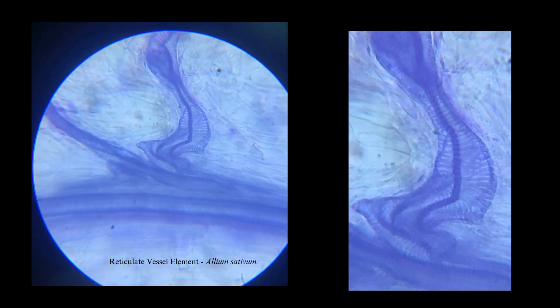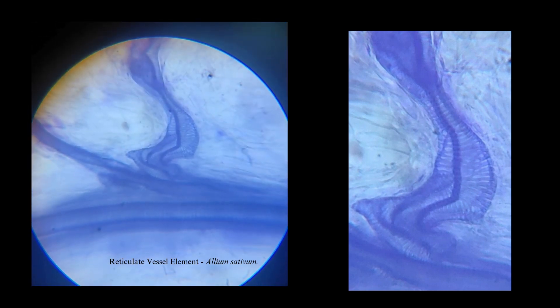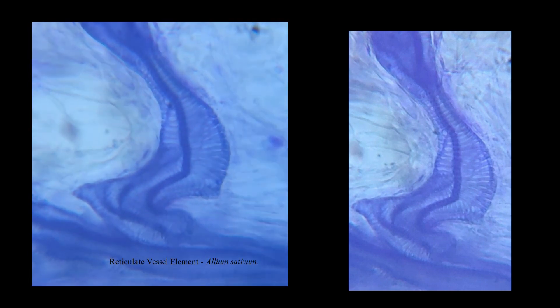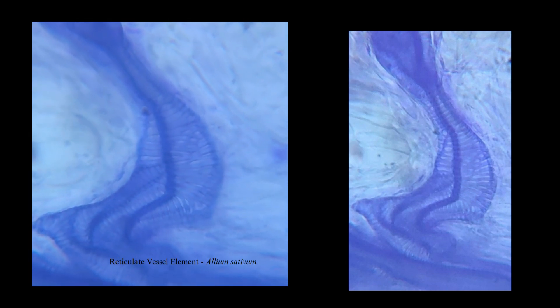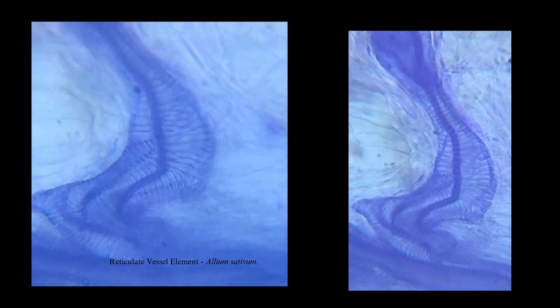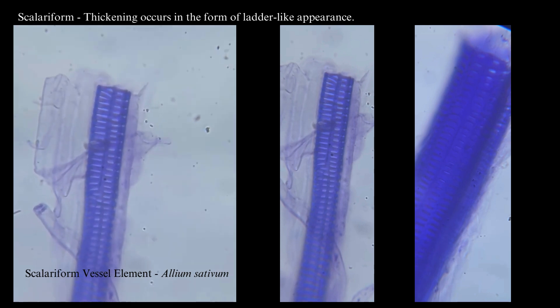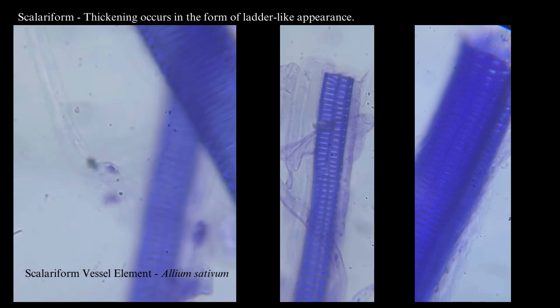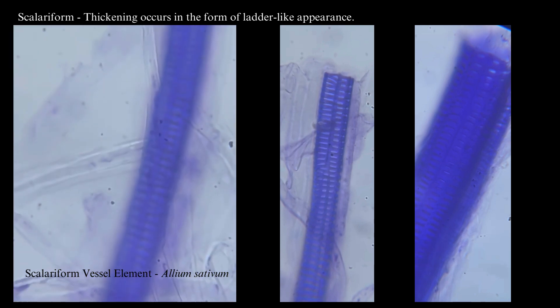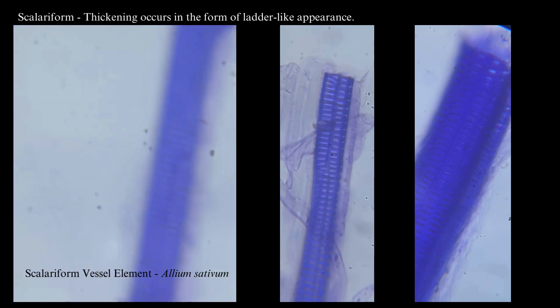Here again is the garlic outer peel macerated slide where you can see the tracheary element with the reticulate pattern. This is the scalariform vessel element of garlic flower stalk. Here the thickening occurs in the form of a ladder-like appearance, therefore it is called scalariform.